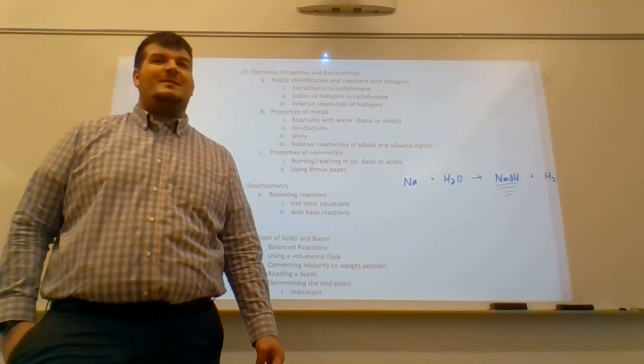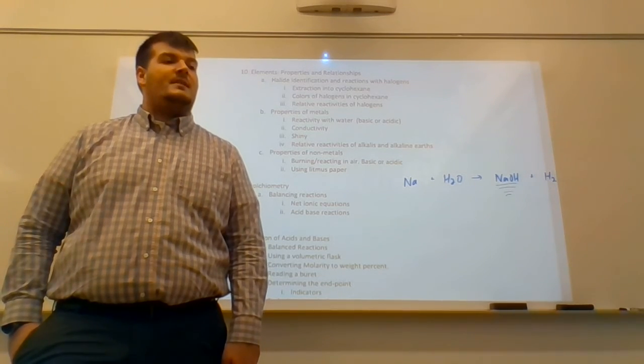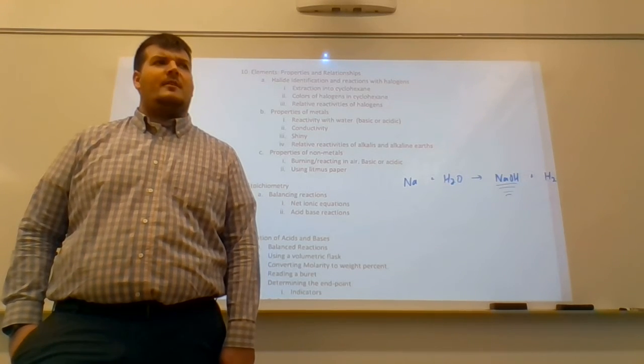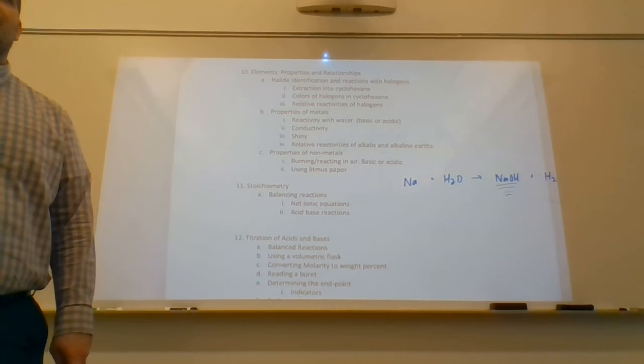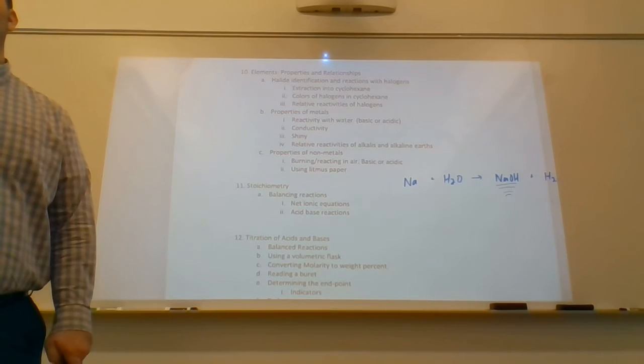Nothing. It was still neutral. So it said in the instructions, if you test it and it's neutral, then wait a little bit, right? Wait 15 minutes or something. I don't remember what it said. You guys came back 15 minutes later, tested it again, and it was? It should have been basic.